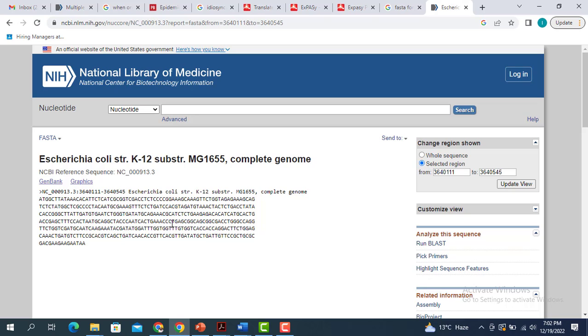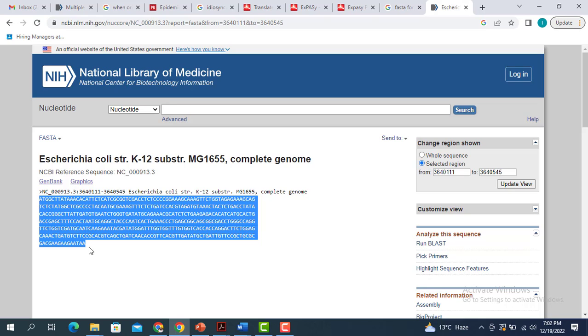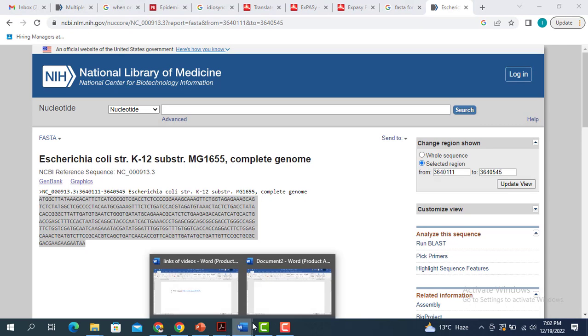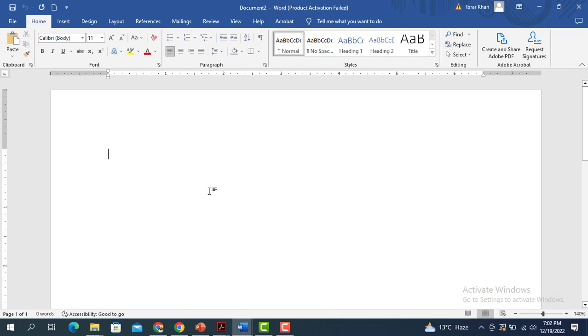You can simply copy it and paste this in a Word file for later reference.